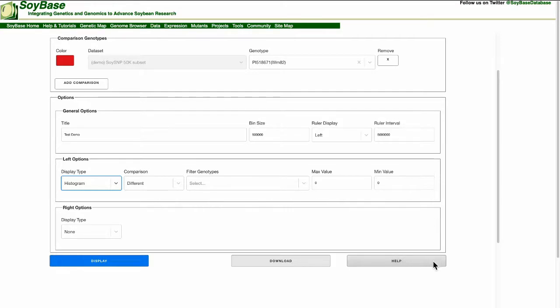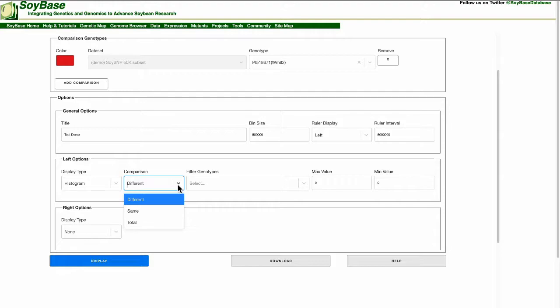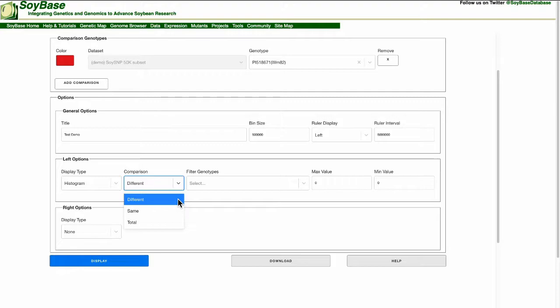For comparison there are three options. These options are total, different, and same. The total option shows the total number of SNPs within that data set. The different option displays only the differences in SNPs between the two selected genotypes. And finally the same comparison displays the SNPs that are the same between the two selected genotypes.